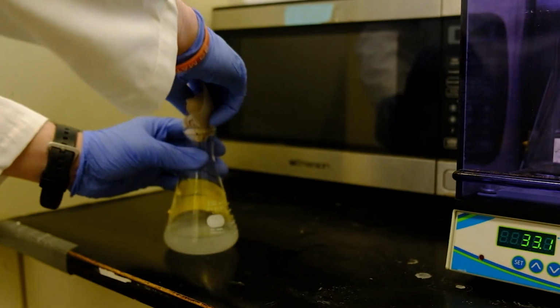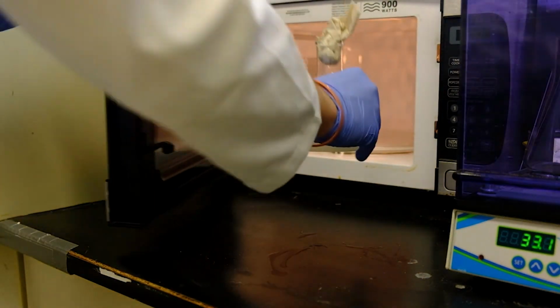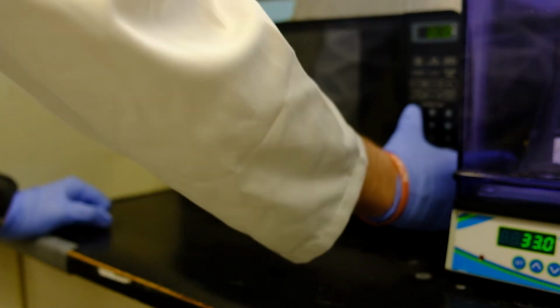Crumple up some tissue and use it to plug the neck of your vessel. Then put it in the microwave and start heating.